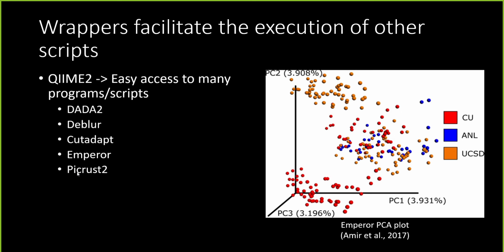And then you also have added functionality, like you can use other programs or packages that people develop for QIIME2, like PICRUSt2, that I've recently found out.